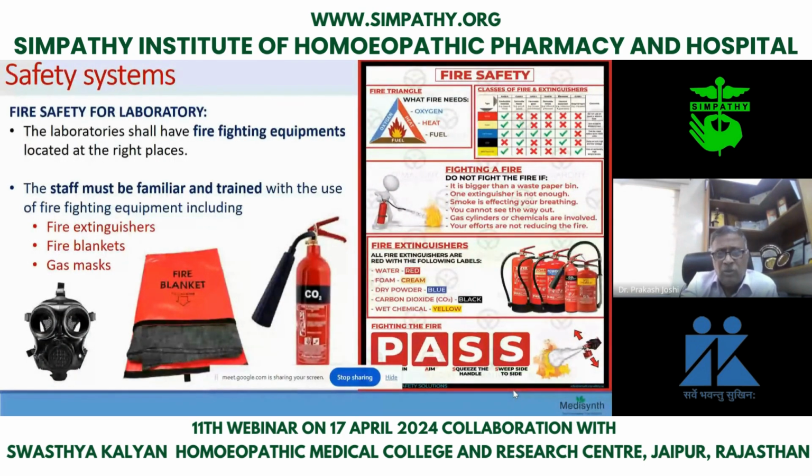Then there should be a common drill, so that one should know what to do. I have seen educated people; there was a fire in a scooter, petrol, and they were putting water. So where to use water, where to use sand, where to use a carbon dioxide cylinder, what measures to follow for what type of fire, that is very important. We should know what type of instrument to be used for what. I will tell you my personal example.